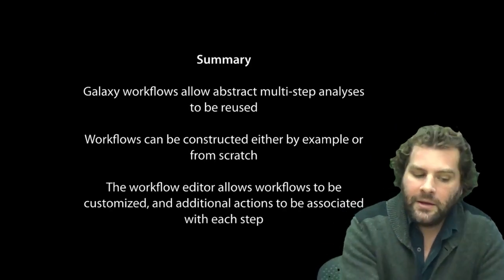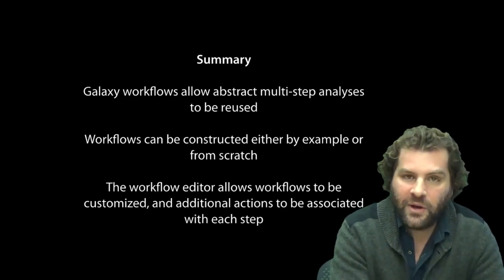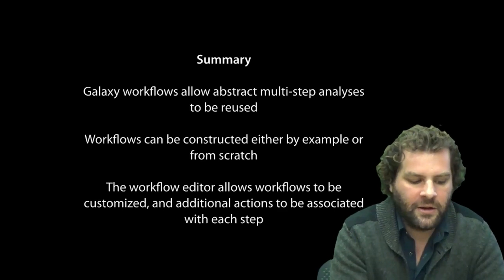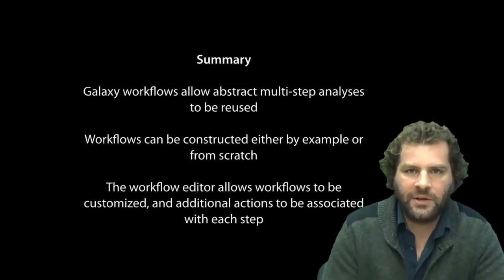So in summary, Galaxy workflows allow abstract multi-step analyses to be reused. They can be constructed either from scratch using the workflow editor or by example using an existing history. And then within the workflow editor, you can customize workflows, adding additional steps, associating actions with those steps, modifying step parameters, etc.